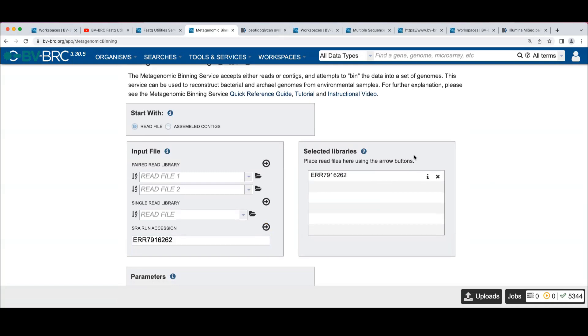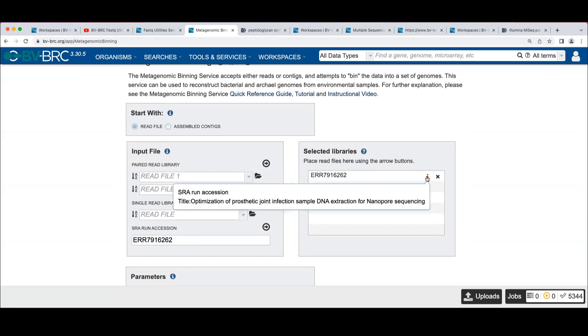By the way, there's this little eye icon here that if you hover over this, it will show you the SRA metadata read title for this read set that you can use to double check that this read is what you think you're putting in.